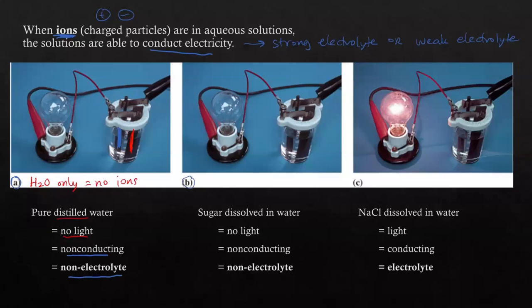Now, this also is a light bulb where the two electrodes have been dipped into this beaker that has a solution in it. Now, this solution looks like water, but it's not just water. There's sugar dissolved in water. It's sugar water. Now, sugar is a polar compound. Sugar has the chemical name sucrose, and that is a polar compound. And polar compounds will dissolve in water.